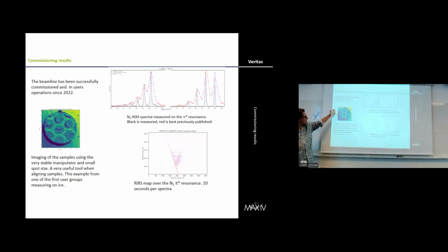So basically we have the X-rays, and then you scan the sample and you create this image, and you can clearly see where you have your sample and where you are on the honeycomb sample. And this is what I mean. It's very important to have this in combination.